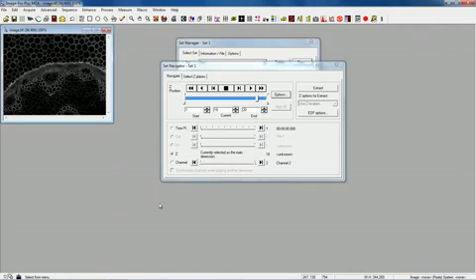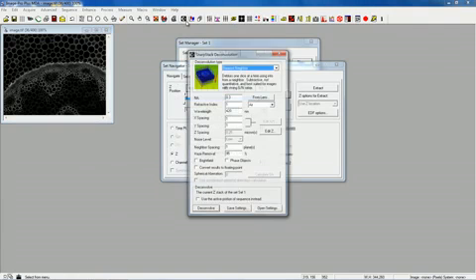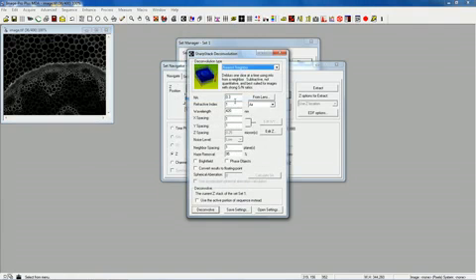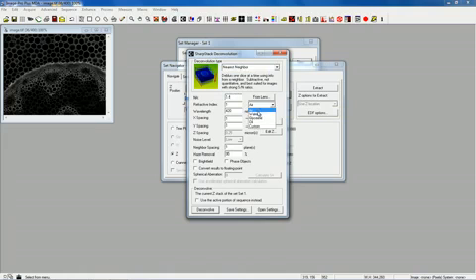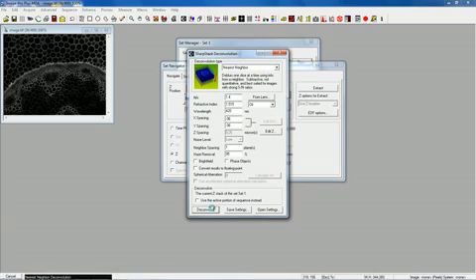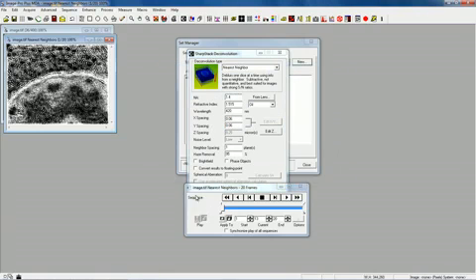OK, so now maybe I want to just do a quick deconvolve. So I'll just come in here and say, OK, I'm going to say it's 1.4 NA, oil, 0.06, 0.06, and I'll just deconvolve that very quickly with the nearest neighbor.